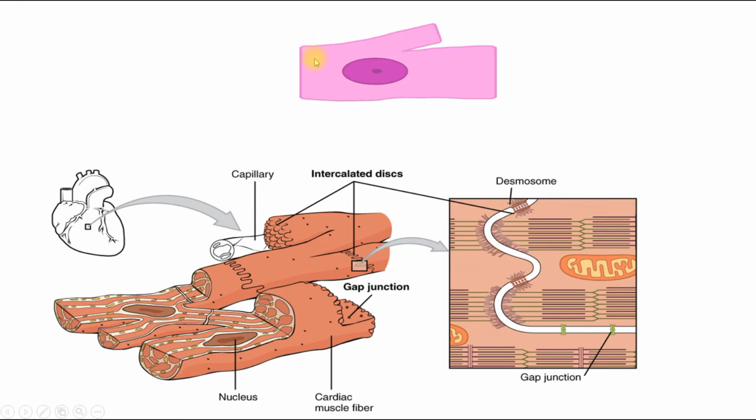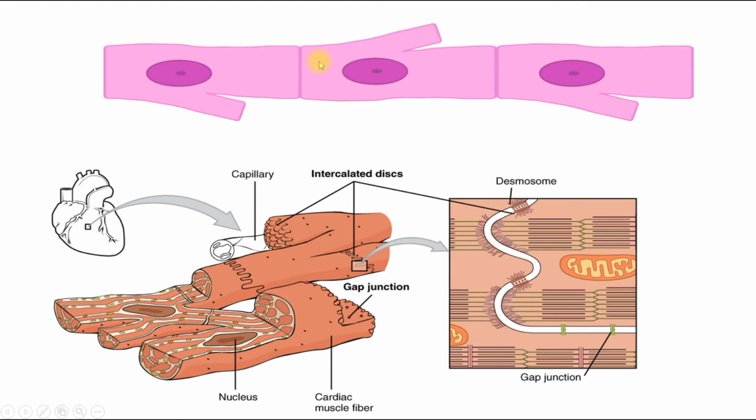And cardiac myocytes are attached to each other end-to-end. Here we can see end-to-end connections, and between them there are intercalated discs with desmosomes and gap junctions which provide connection. Mechanical adjustment is provided by desmosomes and adherent junctions. And gap junctions act like electric synapses. They participate in the conduction of the wave of excitement.